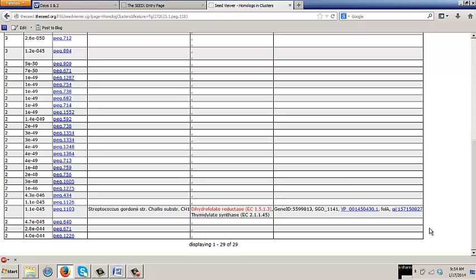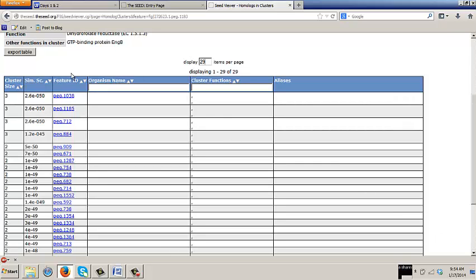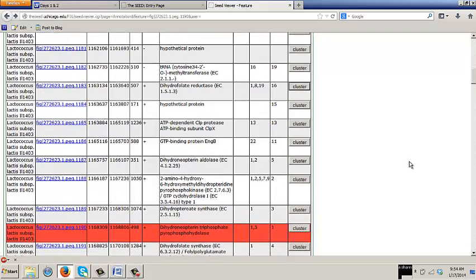The different rows, do they all come from the same organism and they're different clusters from the same organism, and only in that one cluster the genes are found? Or what does that table actually mean? Okay, so SEED is a distributed system. If you wanted to, you can install a version of this on your own university and load only the genomes you want, only the subsystems you want.